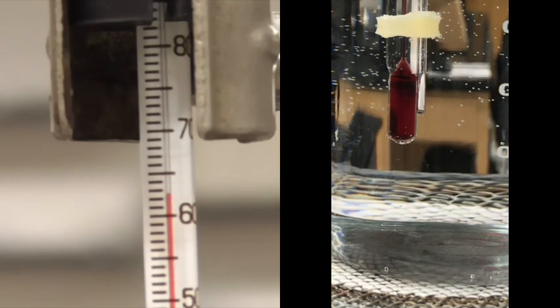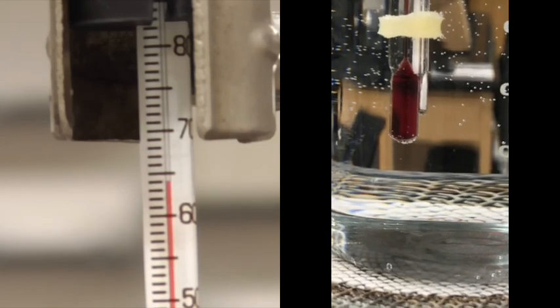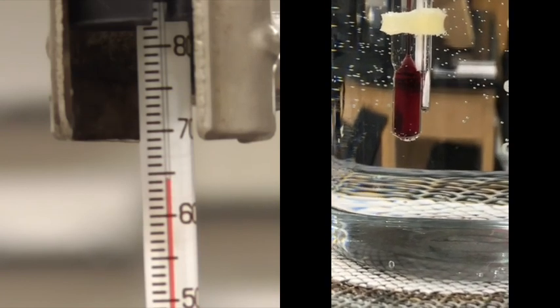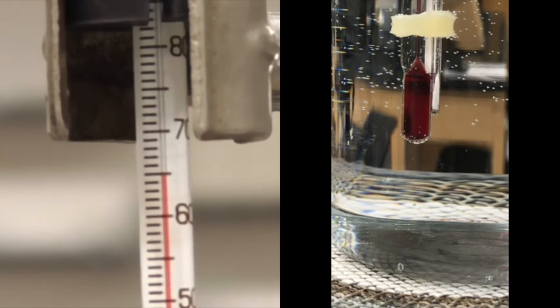We're at 63. Not seeing any melting yet. 65.